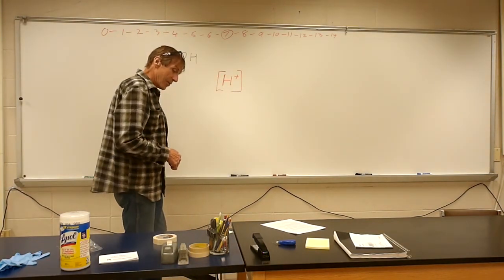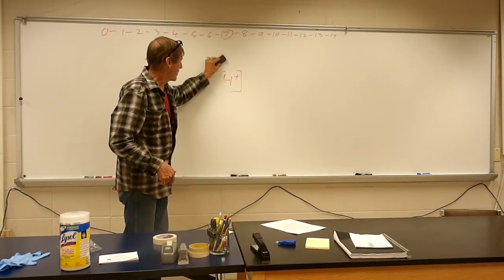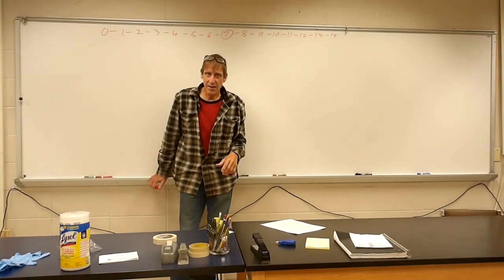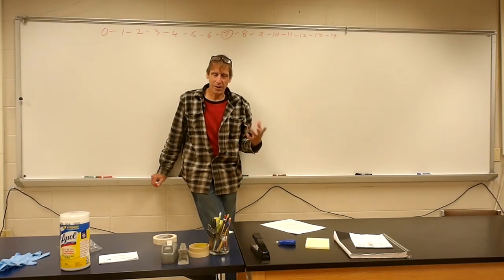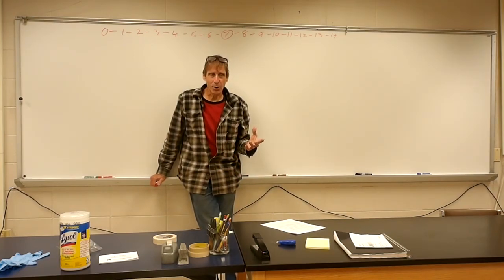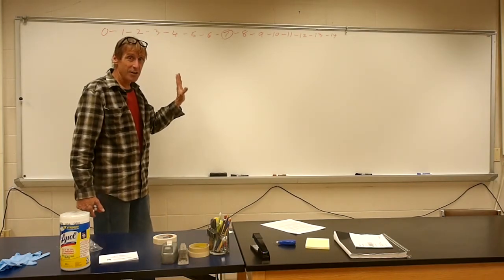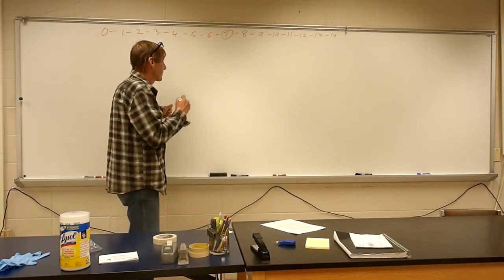And a couple things to note, because we use this pH scale a lot. If you have a swimming pool, you might have little test strips you stick in there to measure the pH. It ensures how well your chlorine's working, condition the water. If you have an aquarium, you measure the pH constantly to make sure it's the right pH for the species of fish you're keeping. And a few points I'll just mention on this scale briefly.